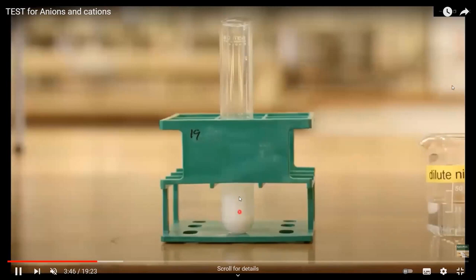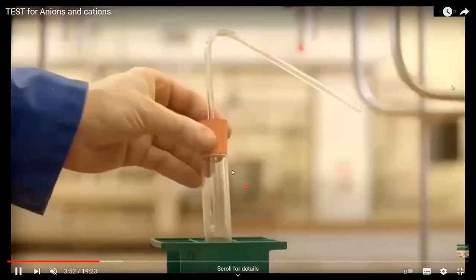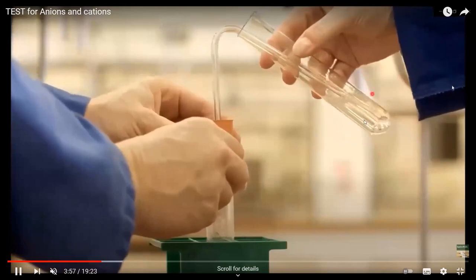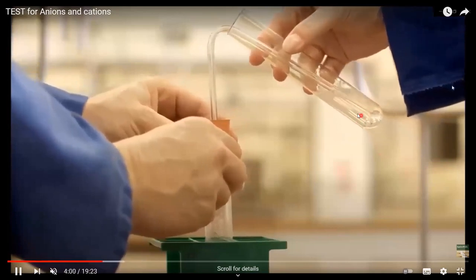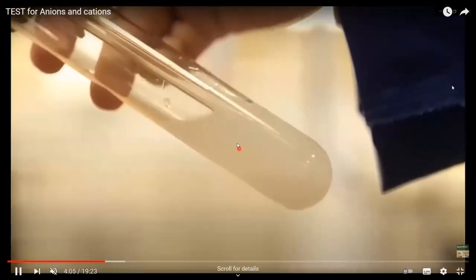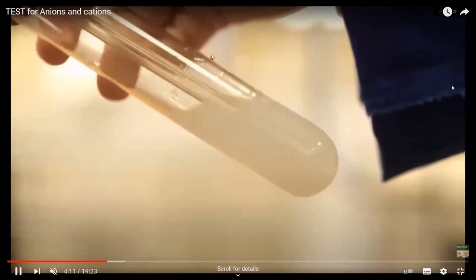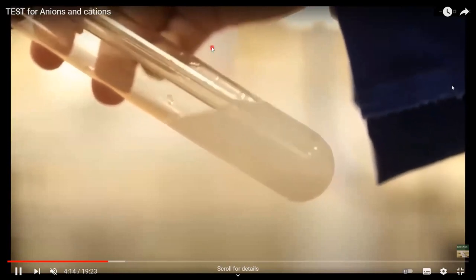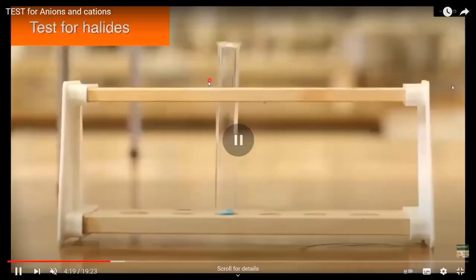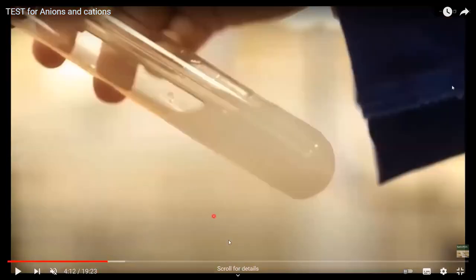This carbon dioxide gas is released whenever carbonates are reacted with acid. And this carbon dioxide gas, we are passing through lime water. This lime water, which is calcium hydroxide, what happened to the lime water? The lime water will turn milky or chalky. The lime water turning milky confirmed the presence of carbon dioxide, and release of carbon dioxide means that there was a carbonate ion. Is it clear? The previous one, the carbonate. Any question or doubt till carbonate?